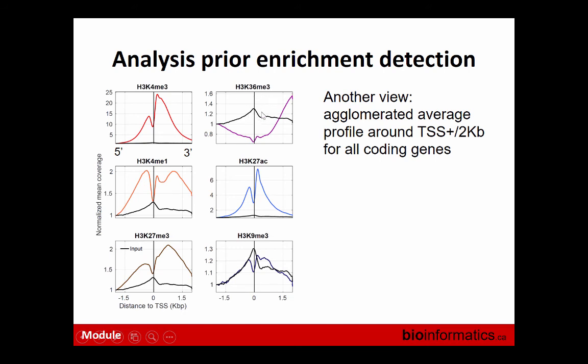And this type of behavior is very experiment specific. I can't say that you always see a peak, sometimes you see a trough. In fact, from my experience, depending on whether it's single-end or paired-end data, you see different features, but it is related to the structure of chromatin. If chromatin is more open at the TSS of the gene, it's easy to shear and the fragments will start more readily in this location. So that's why we might expect this. And then there is the H3K27 acetylation, which is not repressive, it's an enhancer mark, and it also looks very similar to H3K4me3, with a double-hump picture. Most of them will have a trough at the TSS just because there are no nucleosomes there.